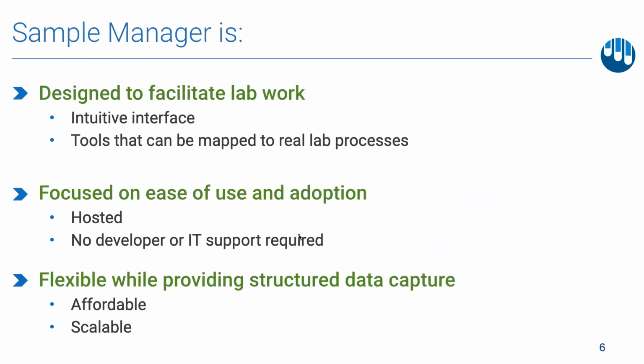As a scientist who works at a company that has a mission of helping teams overcome laboratory data management challenges, we were determined to create a product that did better. Something that focused on increasing efficiency in the lab, was easy to use, and had a low administrative and cost burden on our clients.